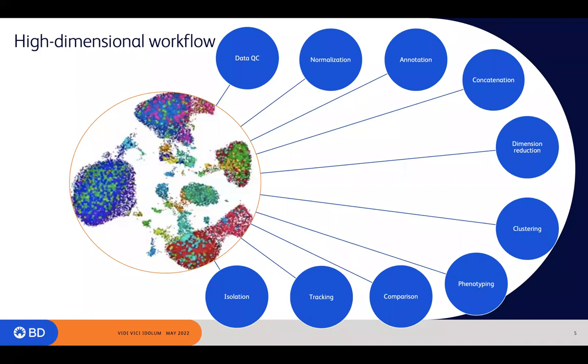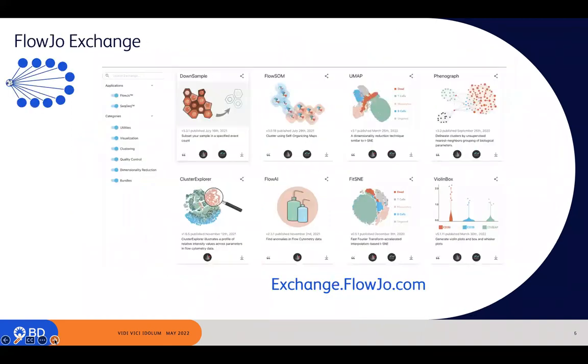So let's see here. I need to advance to the next slide. And apparently I have to do that using the little arrow down at the bottom.